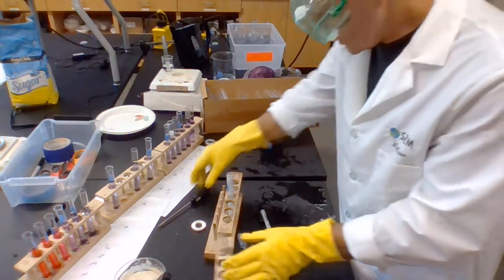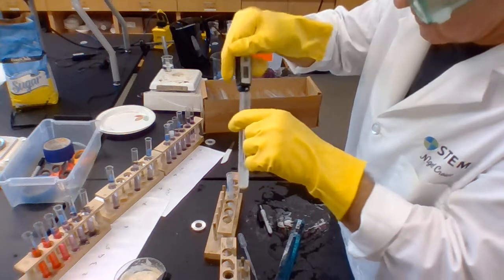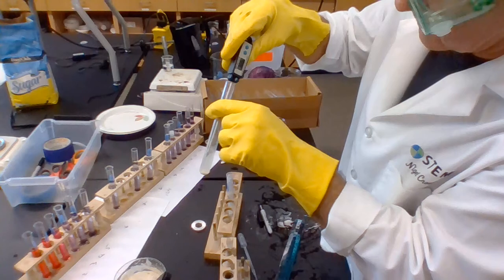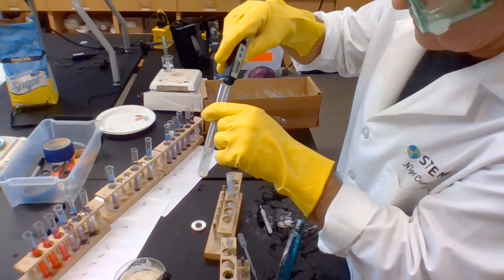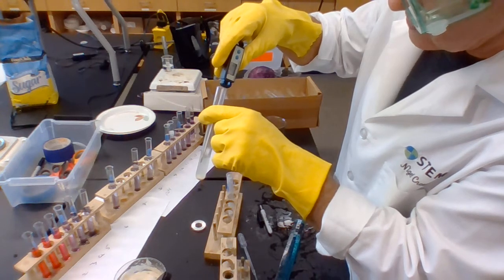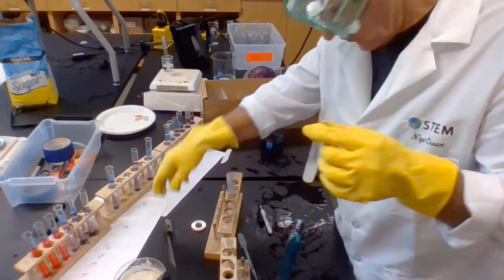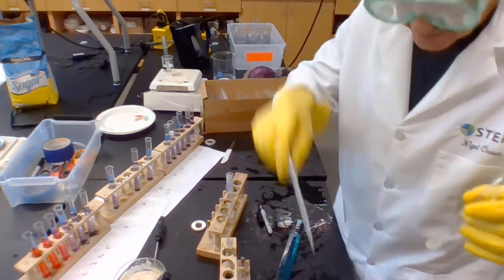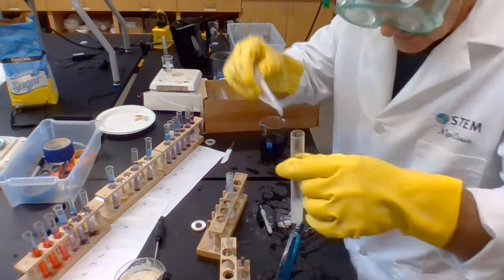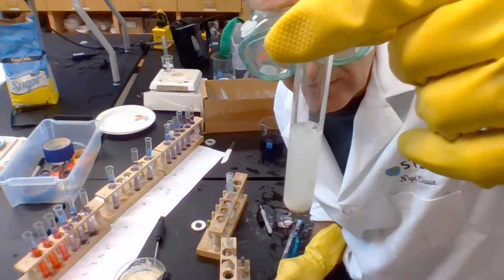Now my next little thing here has been in the freezer. It's been out for a little while I've been preparing the video, and now it is 14, 12.5, 12.3. I didn't obviously get it down to 0 because it didn't actually freeze, and it's now 12.7, 12.8. So now I'm going to take the same amount of hydrogen peroxide that I had before, plunge it in, and it's not doing much at all.